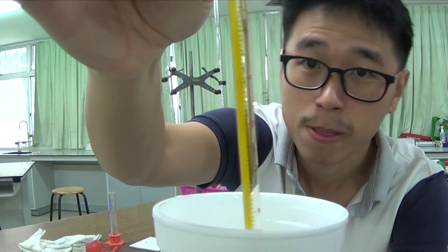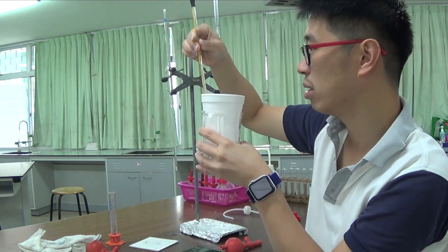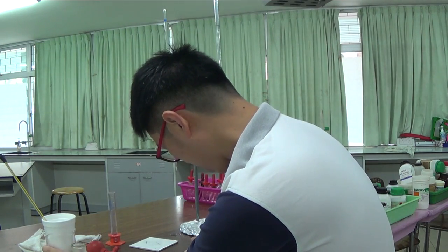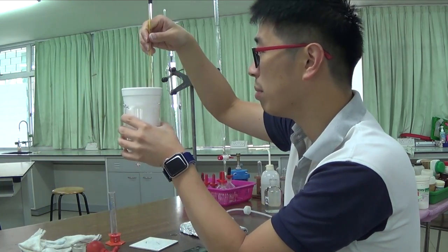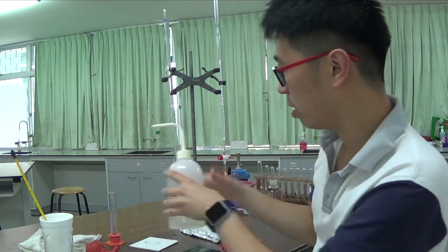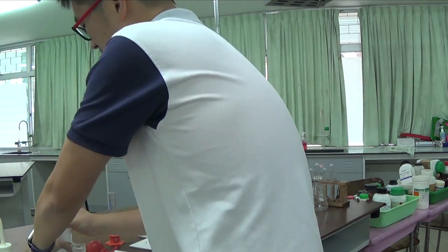Not very clear. Is it clear to you? It's not very clear to you, is it? Okay. Doesn't matter. It's around 32.0. So it seems like the maximum temperature rise has really been 10. Nope, it doesn't go any higher. Okay, so I'm ready to just do the next experiment again. So I still have two more experiments to complete. So let's rush a little bit.